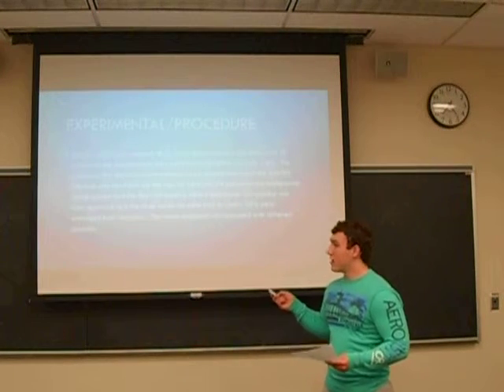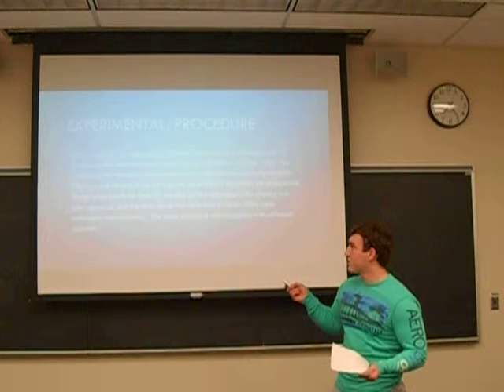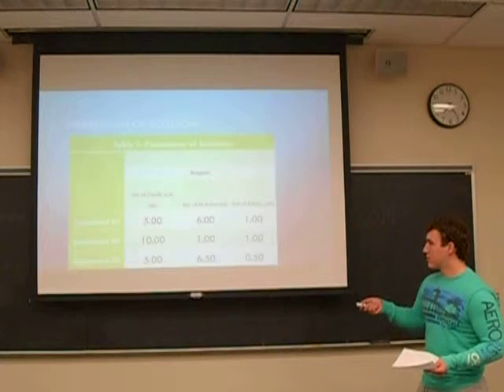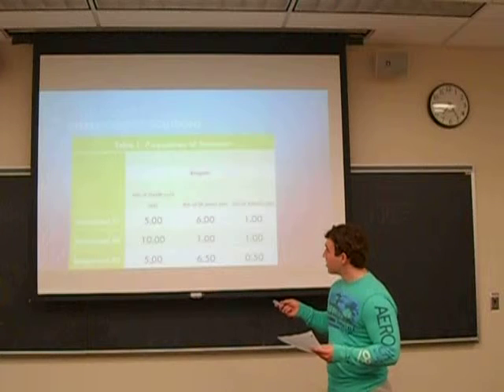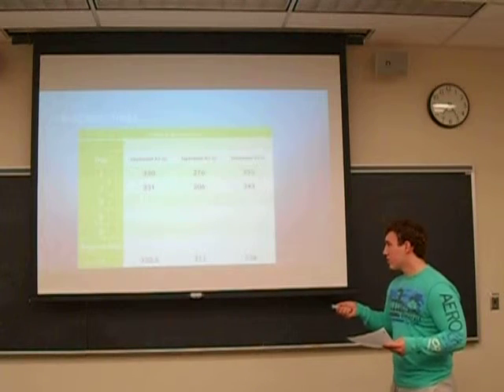And you're going to do this a couple times for each different set of concentrations and volumes. That's actually up here. You did it twice for each of these, each different experiment number, and you would average the times. So here are the average times actually.